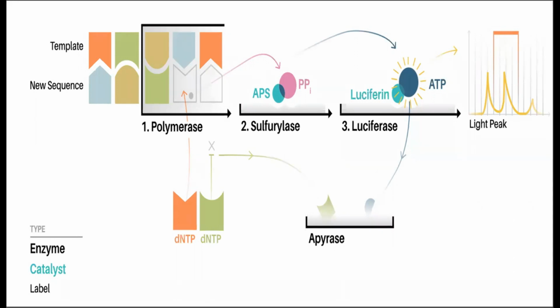So in order for that, what you do is that you attach your DNA to a solid surface so that once you wash the surface, your DNA shouldn't wash off, right? So what you do is that you attach your single stranded DNA molecule to a bead, and that bead attaches your DNA molecule. So the reason how that bead attaches is that, let's say there's a bead over here.